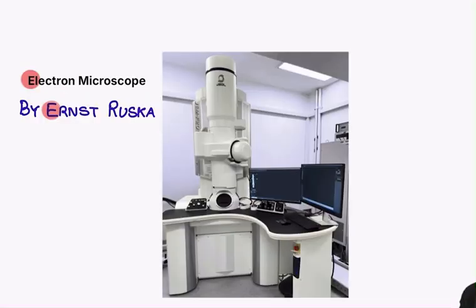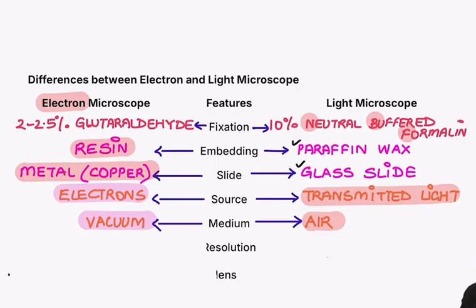Now you understand why this was enclosed from everywhere. I need to create that vacuum, otherwise the electrons will be lost. So for the electrons, a vacuum has to be created. Finally, I come down to what the resolution is.